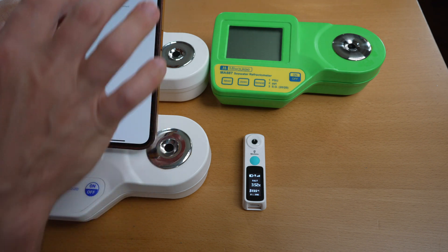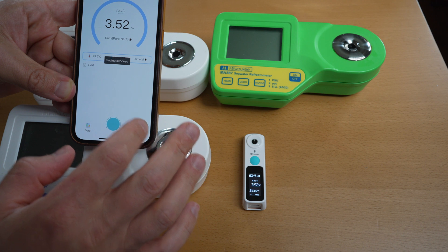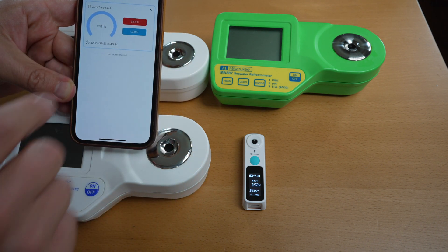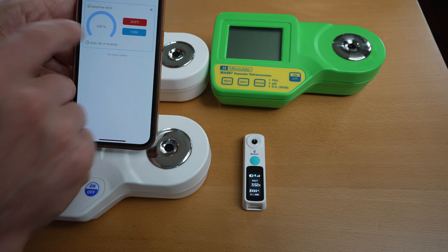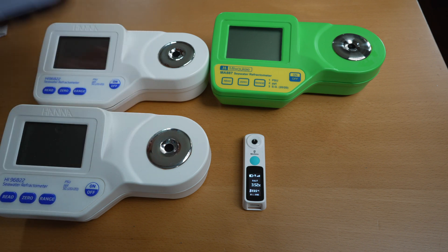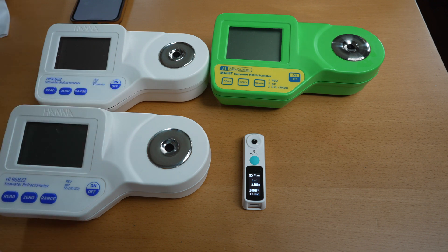If I press the save button, the data appears. The temperature was 23.5 degrees Celsius and the measurement was 3.52%, which you can see is actually pretty accurate compared to the two HANAs. So that's a win in my book.